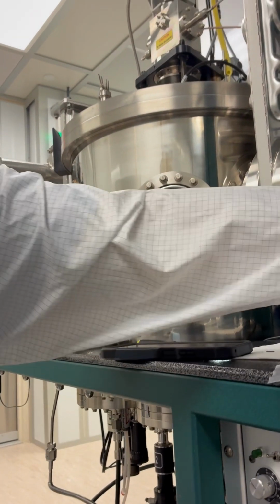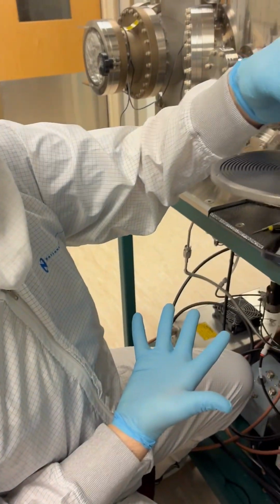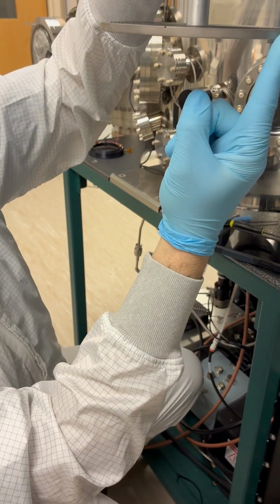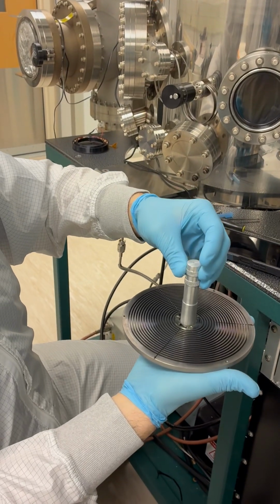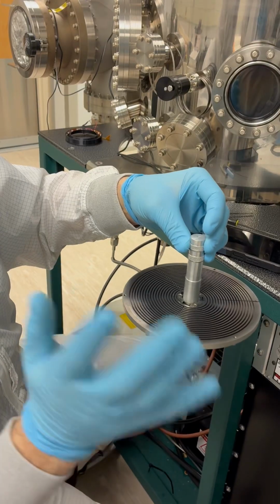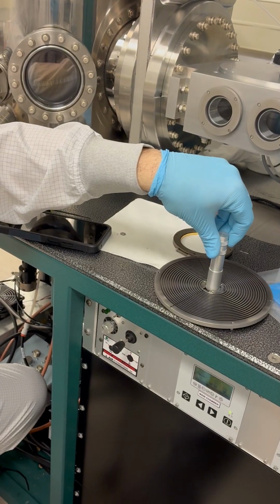Like if I was to bring this down, I'm just holding it like this. I'm trying to bring it down and line this pin up with the two holes on the transfer arm. If I miss, even if I'm in contact, I can rotate it a bit. But very importantly, I can rotate all I want this way, clockwise.